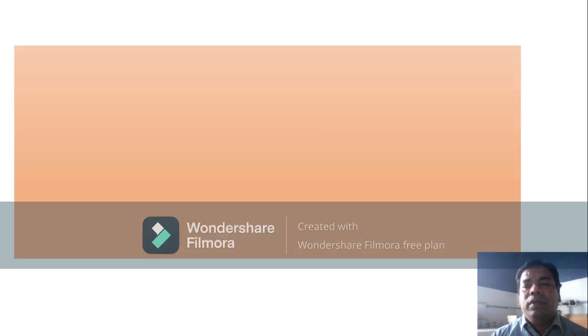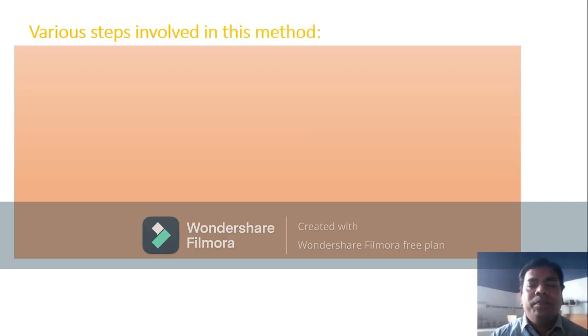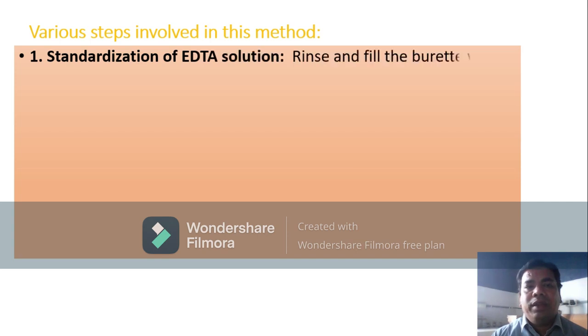Various steps are involved in this process. The first step, second step, third step, we will discuss one by one, step-wise process. You can see the various steps involved in this method. The step one is standardization of EDTA. That is very, very important.